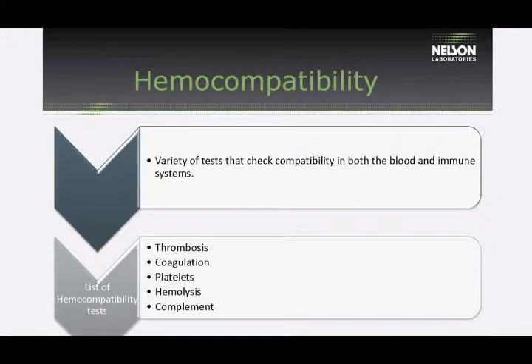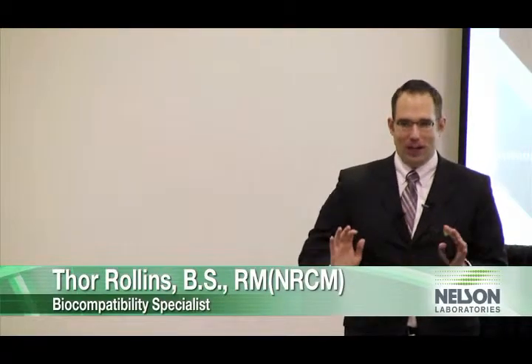Hemocompatibility, in essence, we want to look to see how your device interacts with blood. The most important thing here is we all know that when you have surgery, there's going to be blood present, right? We know, even if you go into like a little pinprick, there's going to be blood. That's not the blood interaction we're talking about, okay? The blood interaction we're talking about here is circulating blood or used blood. You have to have some kind of contact with a circulatory system to be looking at hemocompatibility, okay?